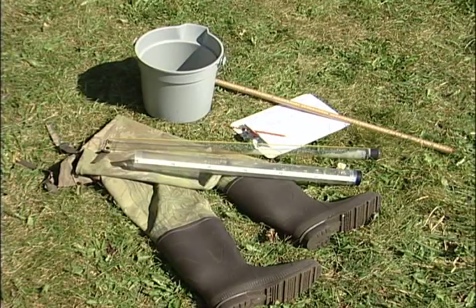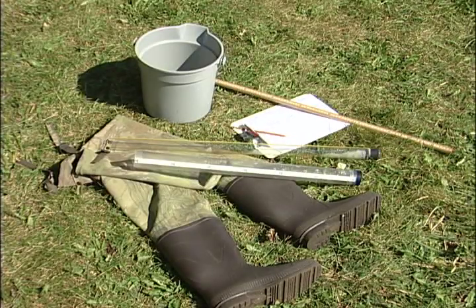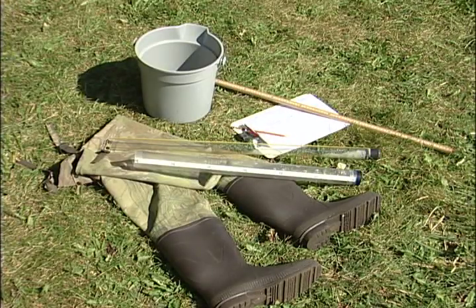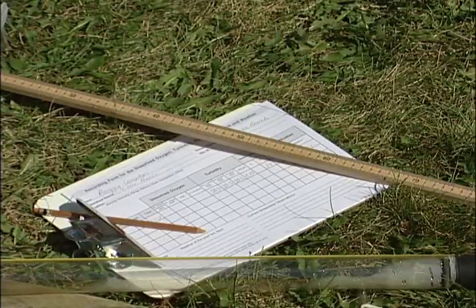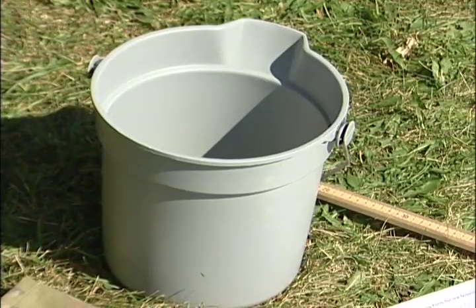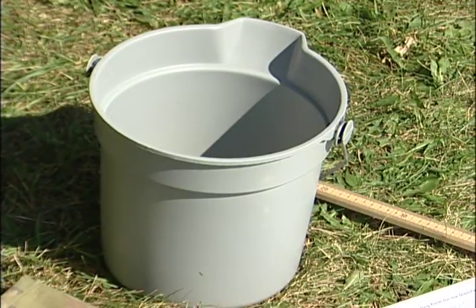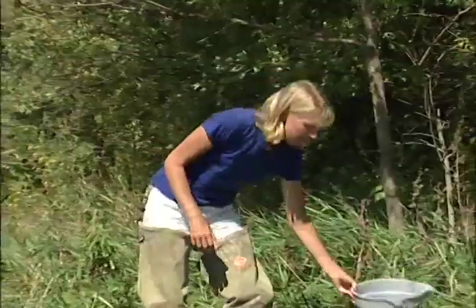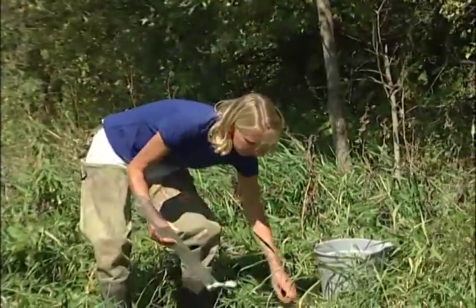To monitor turbidity you're going to need several bits of equipment. You're going to need your hip boots, your data sheet and your pen, a bucket for scooping water and something to stir that water up with, and of course your turbidity tube.